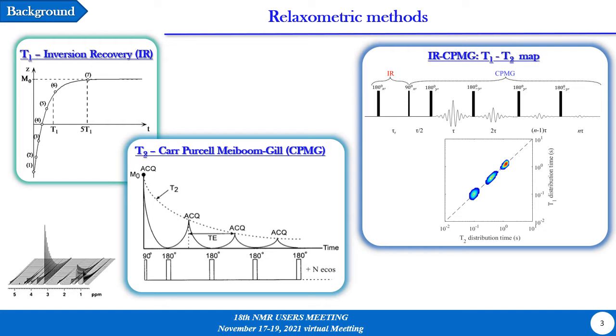Typically, there are several experiments in low field and even in high field NMR that we obtain curves of exponential growth or exponential decay, as the inversion recovery pulse sequences, CPMG, two-dimensional experiments, diffusion experiments in low or high resolution NMR.